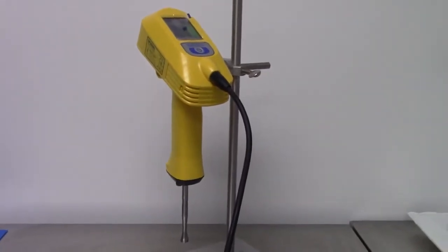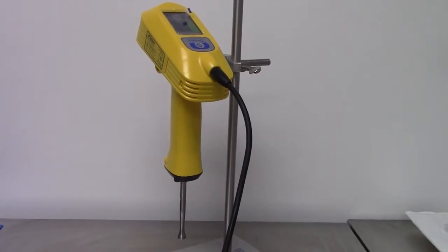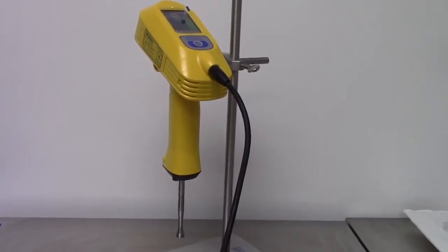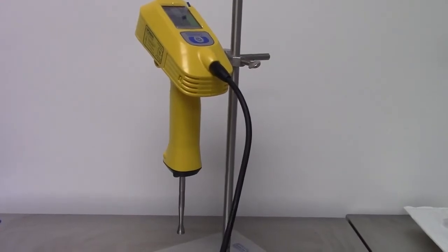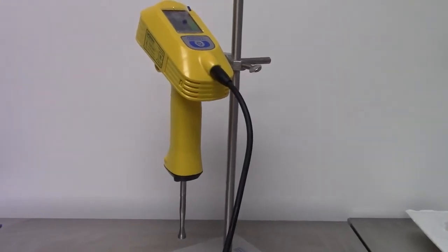Thank you for your purchase of the Hielscher Ultrasonics UP200HT ultrasonic processor. Detailed instructions, including operation and maintenance, can be found on your SD card. Or, if this is not available, please contact your sales representative.